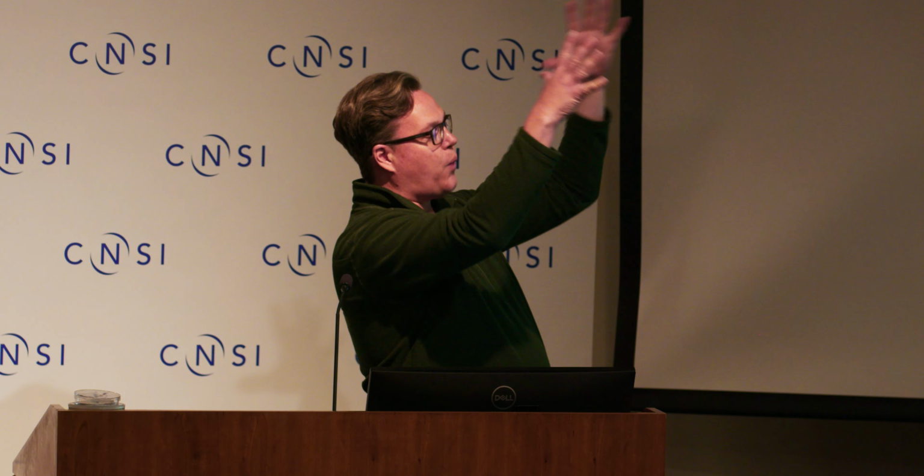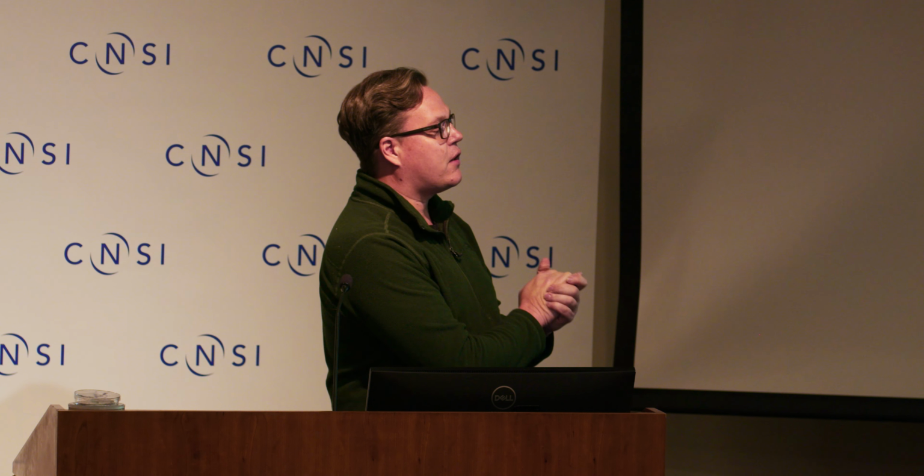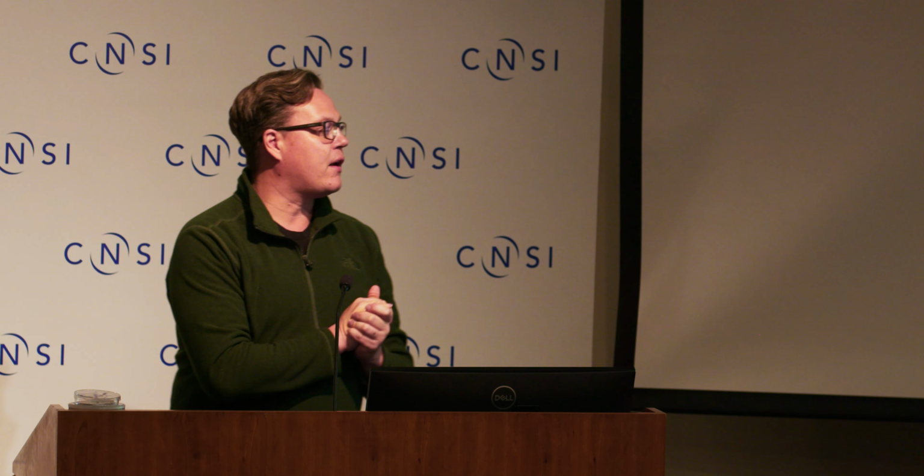This quantum mechanical wave of the electrons actually travels through the sample, gets phase shifted, and then interferes to form an image, and that's what we look at. So this is another example of fundamental quantum mechanics coming in 100 years later and producing these wonderful tools that we use every single day. And then we actually have wavelengths that are about 250,000 times smaller than that of visible light.